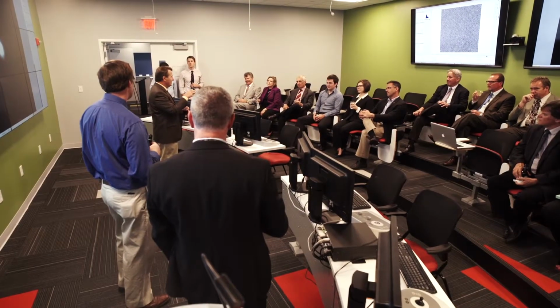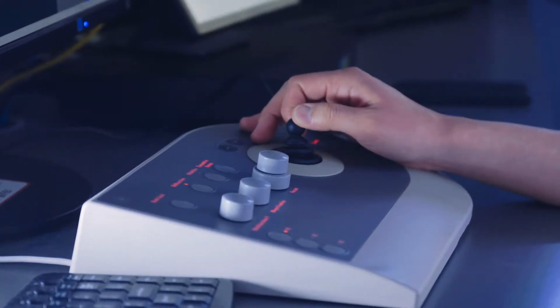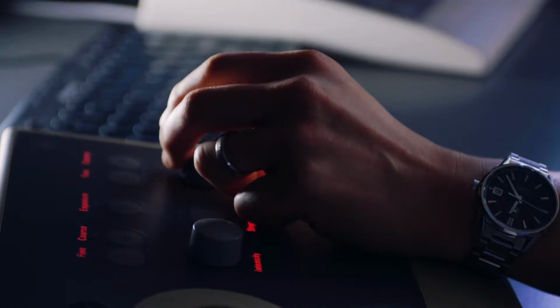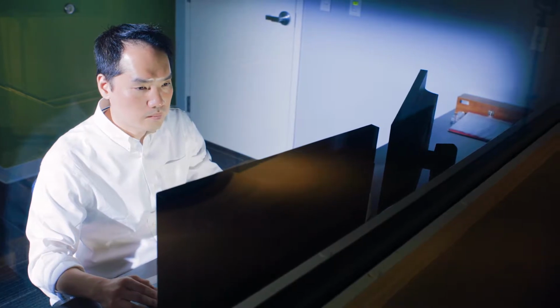People come from all over the world to access CMAS and to use our facilities, and our partners and users are really eager to get their hands on the tools and resources that we have available here. The remote microscopy collaboration that we're building closes that gap, that they have to be present in the facility in order to do the research that they need to do. We demonstrated that we can operate many of these tools from a remote environment, from many hundreds of miles away from CMAS.